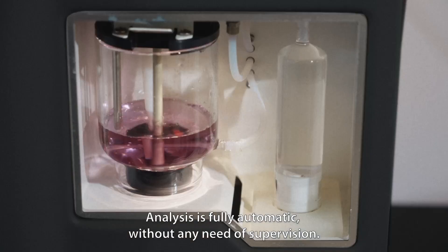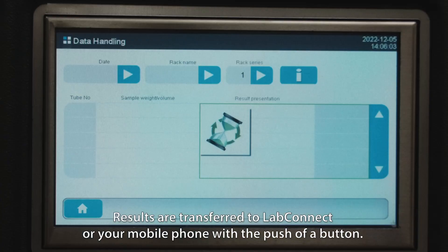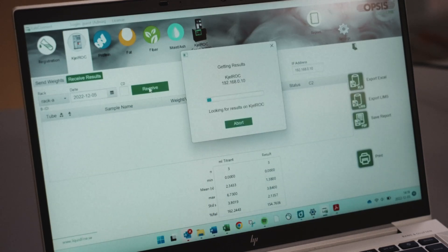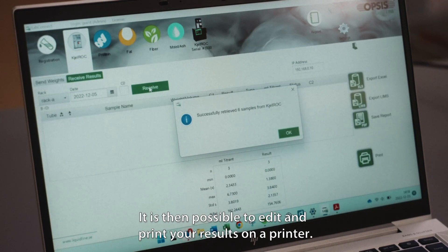Analysis is fully automatic without any need of supervision. Results are transferred to LabConnect or your mobile phone with the push of a button. It is then possible to edit and print your results on a printer.